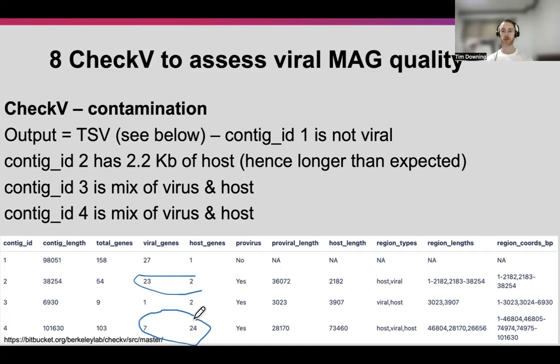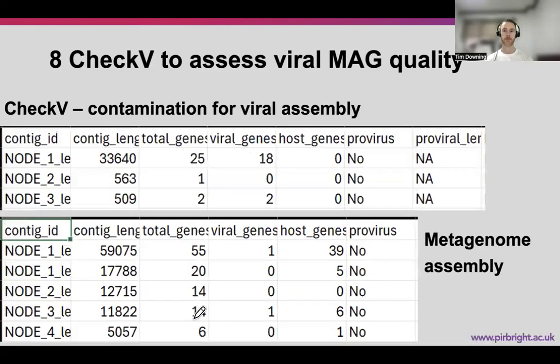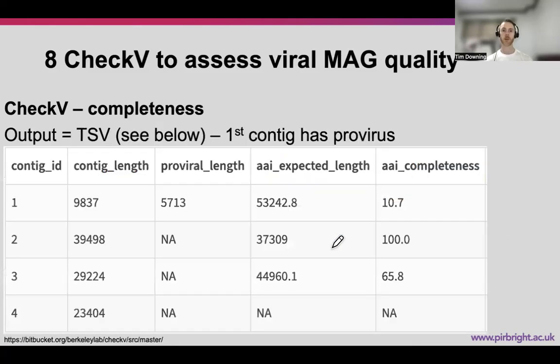So this is the contamination exploration. For our samples, we see that we have mainly viral here, and some host. So it's kind of repeating the same information. The perspective of contamination depends on what you're looking for.